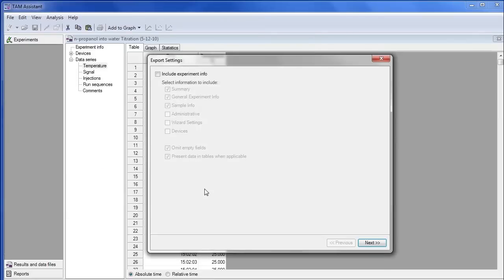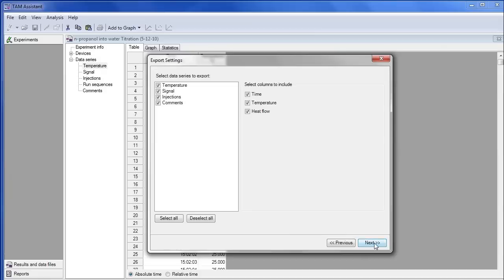Using the default values is fine. I'm just clicking Next. We've already inspected the temperature, so that information is not needed. So really, we just need the signal.